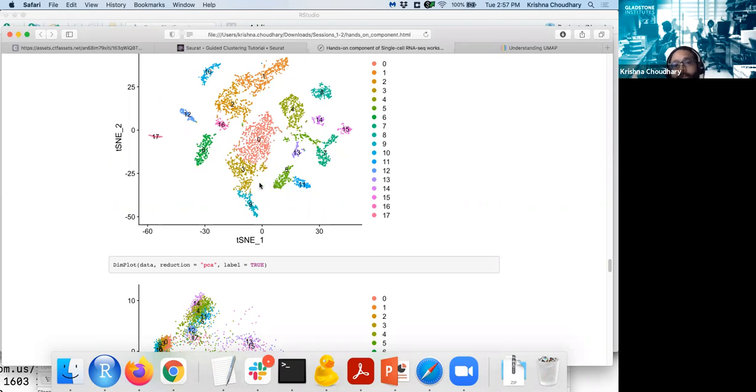Okay, now I will answer any questions that you may have. Please feel free to unmute yourself and ask them. Here we have one in the chat box from Wanping Wang: if I have a gene of interest that shows a trend in developmental trajectory, how do I find other genes showing a similar expression profile?